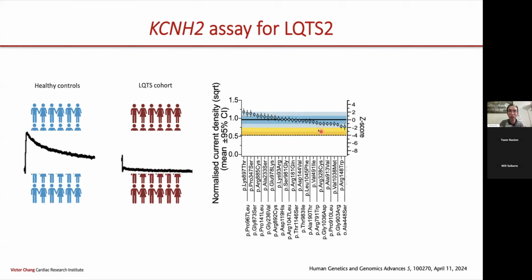This allows us to determine the Z-score system that we use when we interpret a VUS in the future. The Z-score system simply takes the mean of all 30 benign controls here and 2 standard deviations within the mean of the population. These 30 benign population variants are defined as the functionally normal range.